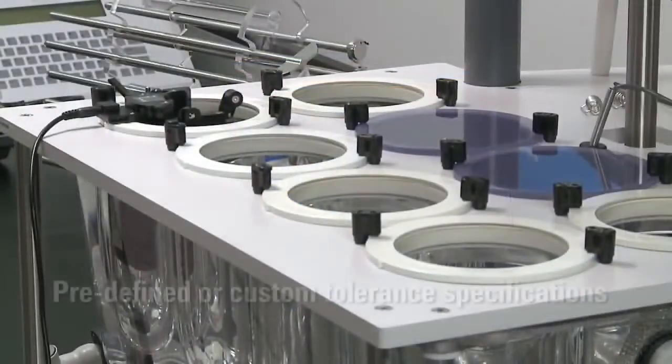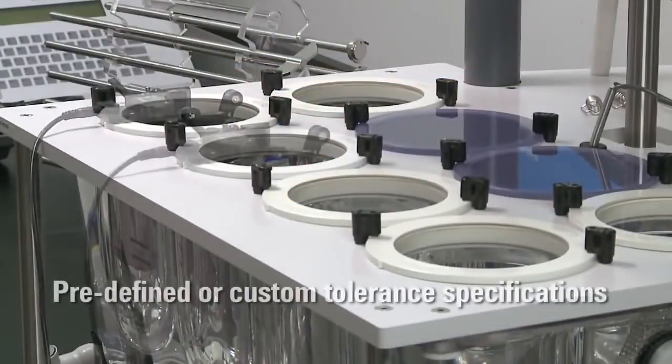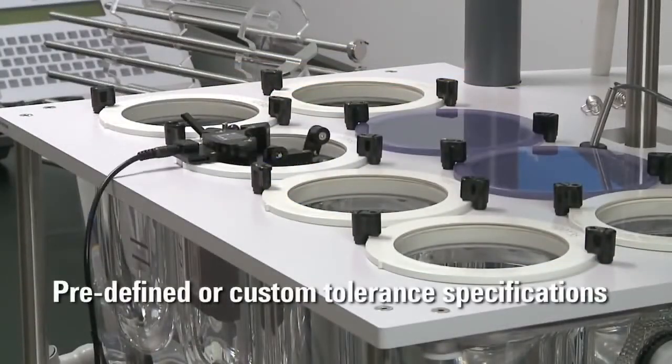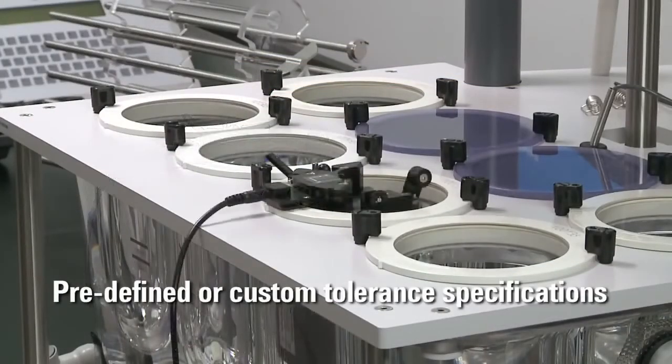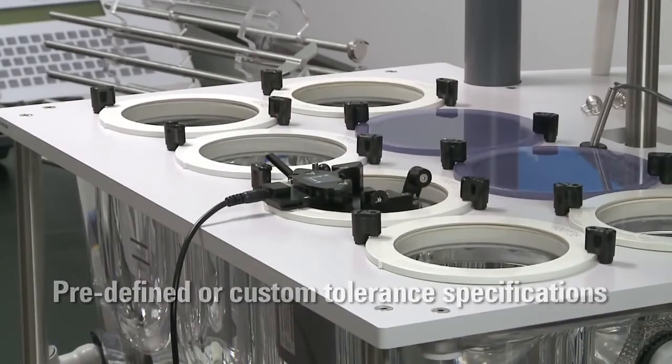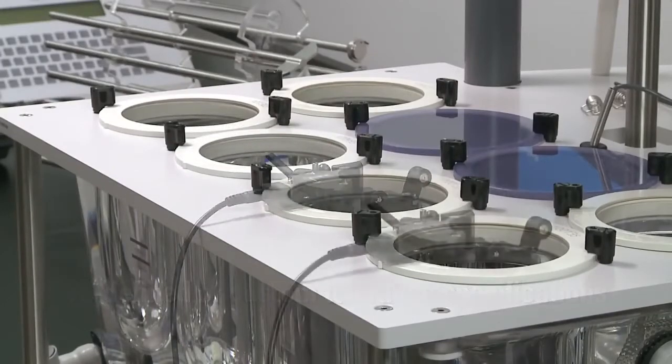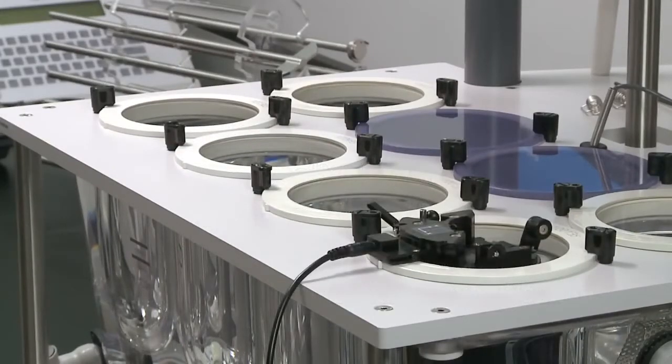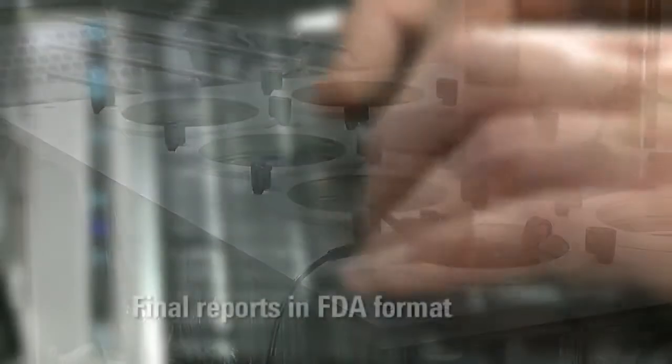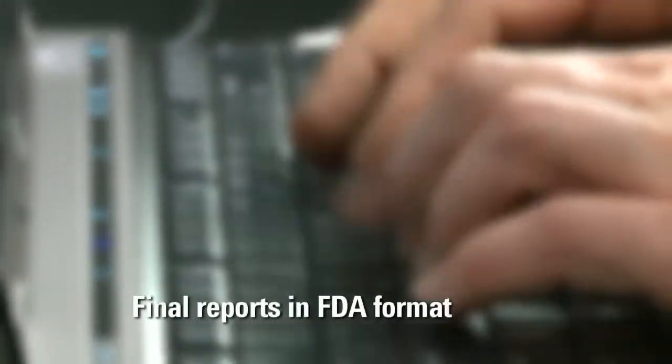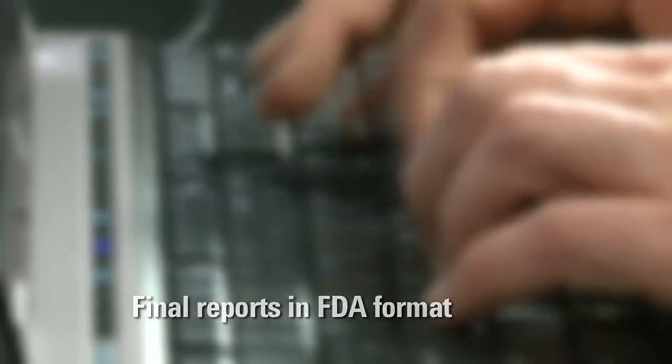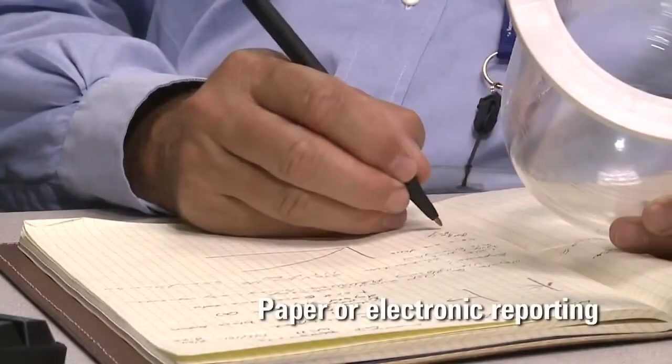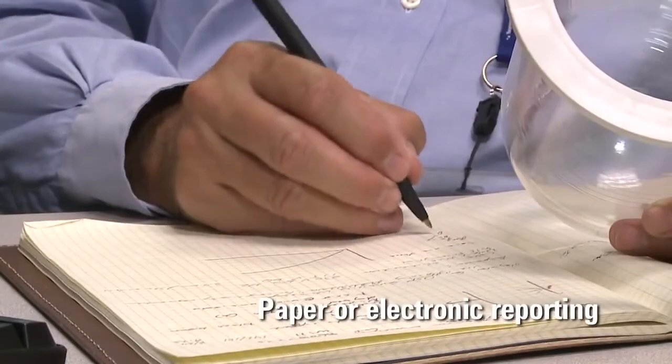Perform each test according to established specifications or customize parameters to meet your own internal requirements. Conveniently search and retrieve data for detailed evaluation based on apparatus, date range, or operator.